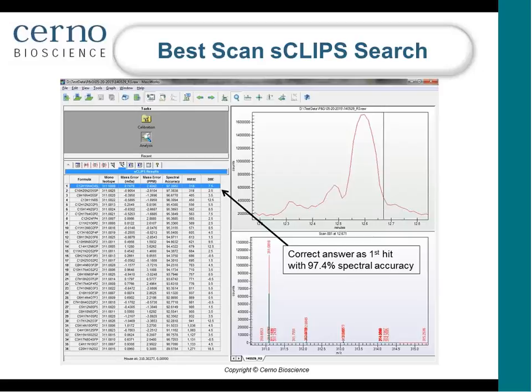So the idea seems to have worked, and the elemental composition can be treated as unknown, and the best scan can also be treated as unknown in this exhaustive search, which can be performed relatively quickly to be practically useful. Of course, more testing needs to be done, so the work will be ongoing with our collaborators to do further investigation, application and analysis.